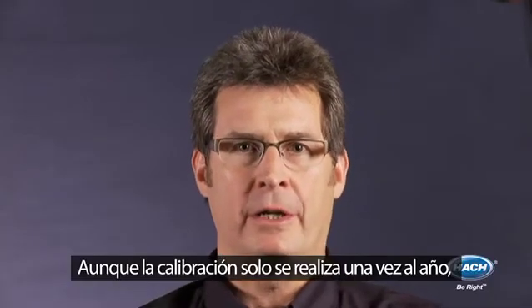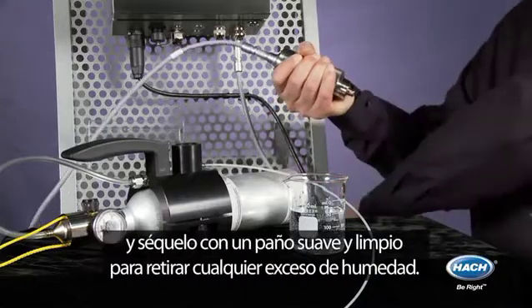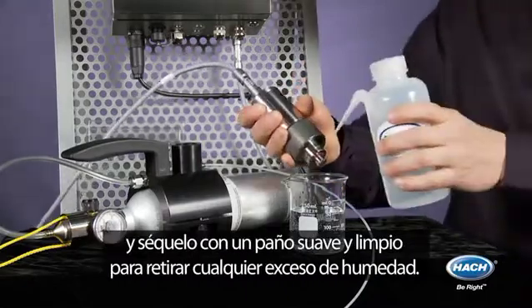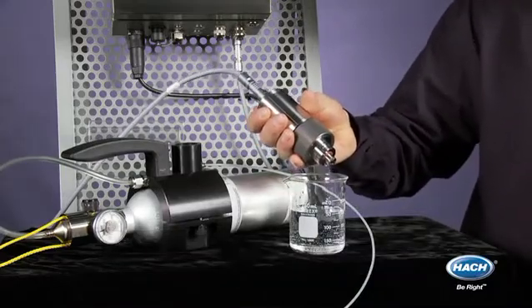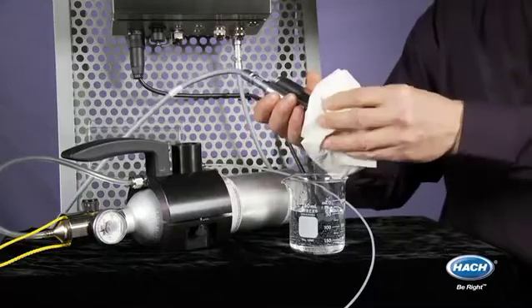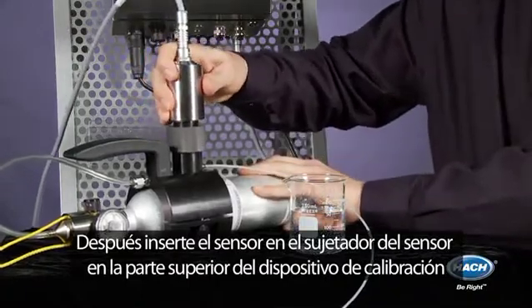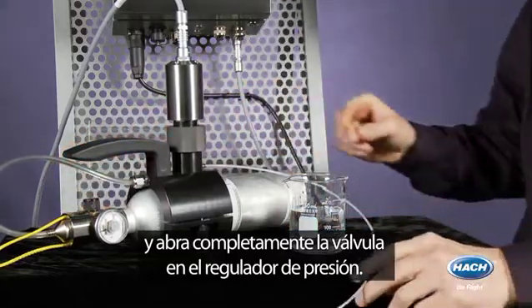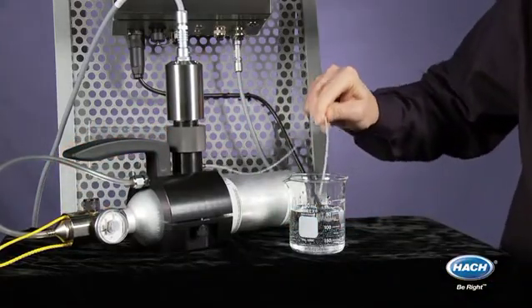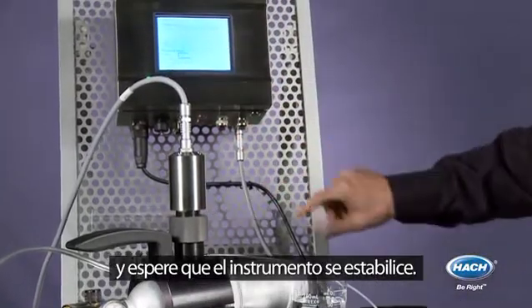Calibration only happens once a year and is also very fast and easy. You simply remove the sensor from the flow chamber, rinse the sensing head with clean water, and wipe with a clean soft tissue to remove any excess moisture. You then insert the sensor into the sensor holder on top of the calibration device and fully open the valve on the pressure reducer. You then simply hit start in the zero calibration menu and wait for the instrument to stabilize.